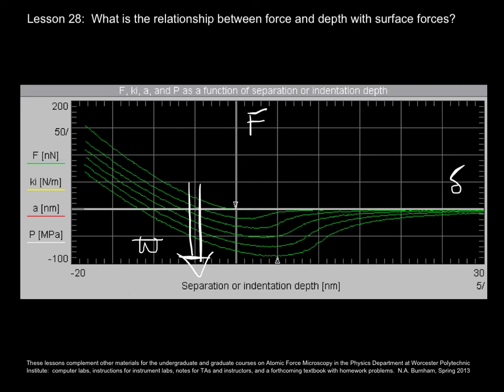And what I'd like you to notice here is how the minima are arranged not vertically down from the origin, but off to the right. So this, once again, is indicating the bulging out of the sample for higher works of adhesion.